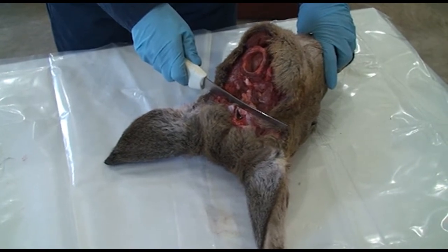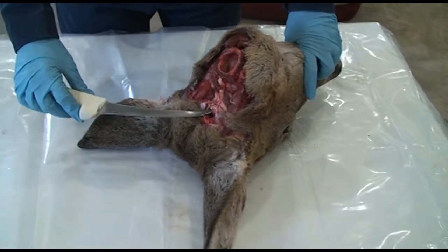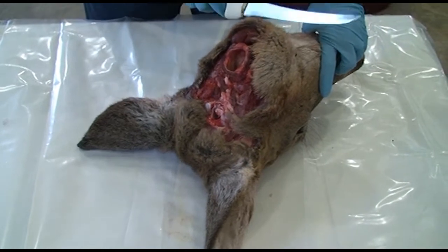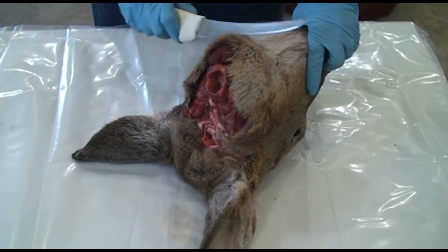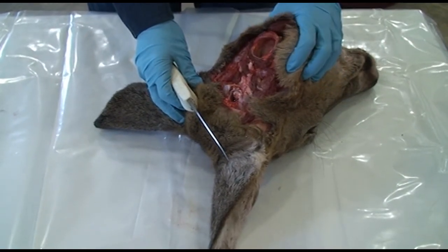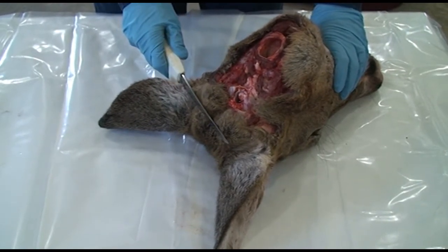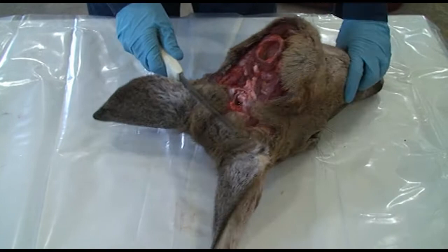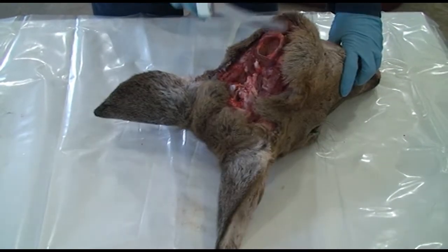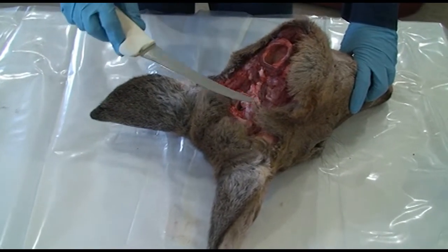If you are too far back and get back a joint, you won't be able to get to where you need to remove the obex, the part of the brainstem that we need to get. If you're too far forward and angle your knife from here back, you could slice off the retropharyngeal lymph nodes, and then you won't have those for sampling, or you'll have to go find them attached to the other part that you just cut off, which makes it a lot harder. So if you use your landmarks, curve of the jaw, base of the ears, move the head and go straight down, you should hit these occipital condyles, the base of the skull.